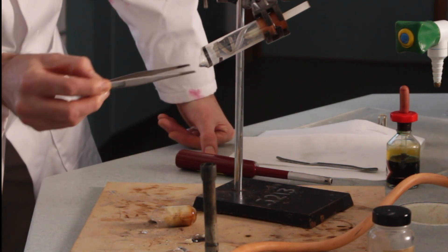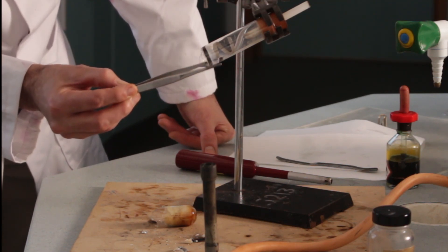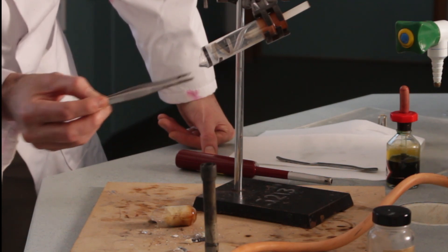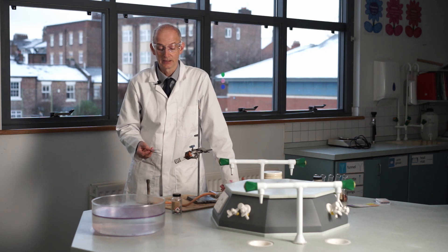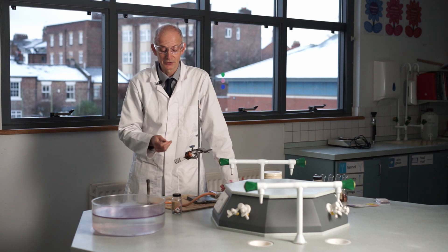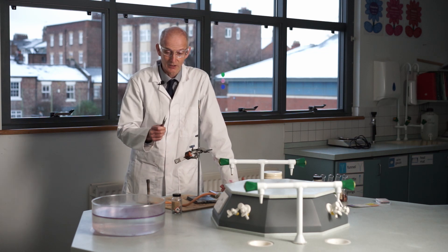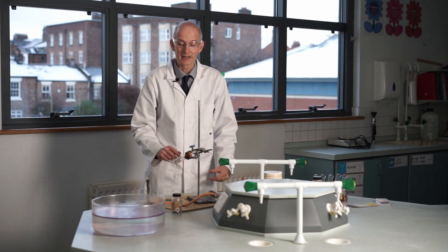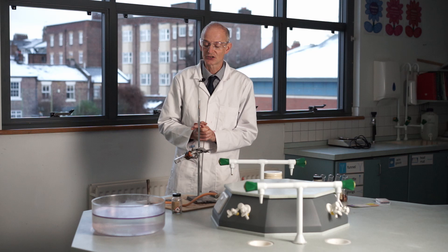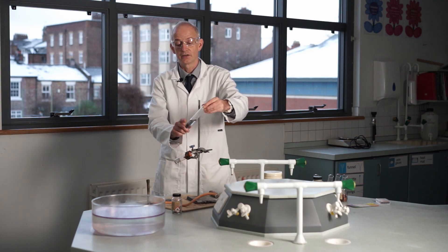We can get magnesium to react with steam and it gives us a white residue inside the tube — a white compound of magnesium. I can scrape it off. This white compound came from magnesium plus steam (H₂O). The flammable gas is hydrogen — the hydrogen from the water came out as gas, and the oxygen from the water stuck to the magnesium, giving us magnesium oxide (a white solid) and hydrogen. Magnesium reacts much more spectacularly with steam than with hot water, because steam is well above 100°C.